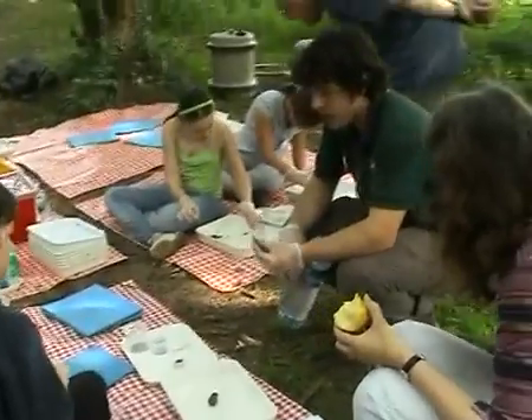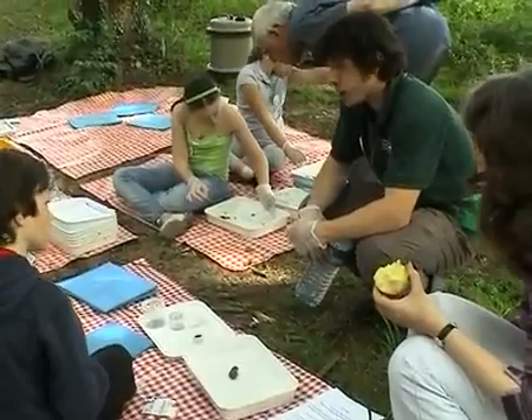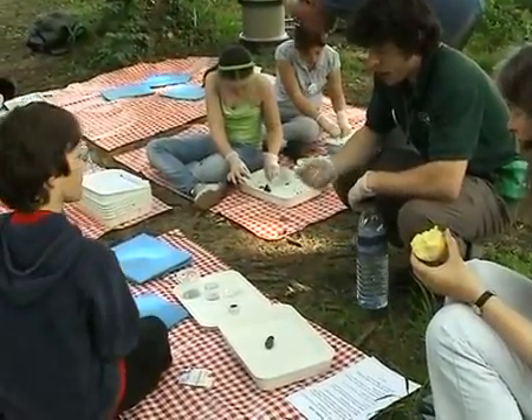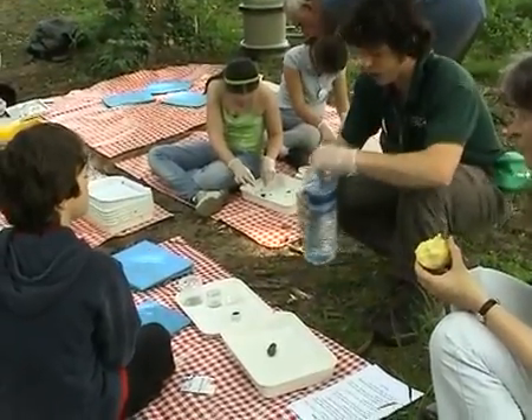We're still going to wear gloves just in case, and after we finish we'll get a chance to wash our hands and everything. Just be aware and dry because it's really easy to touch your face — try not to touch your face when doing it.